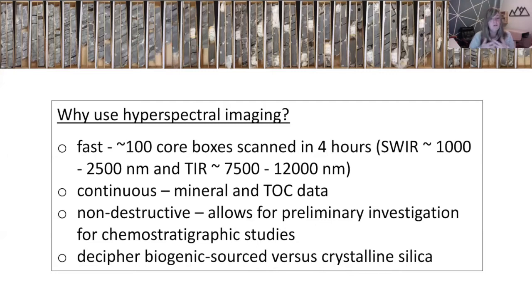But if you do need to take samples, it's also a way to highlight all the heterogeneity in that core in order to appropriately sample it for what your task is. You can decipher biogenic structures and sedimentary structures that might not be visible with the naked eye. And another really interesting thing with long-wave infrared data, you can actually decipher between amorphous silica that may be biogenically derived versus a crystalline silica.